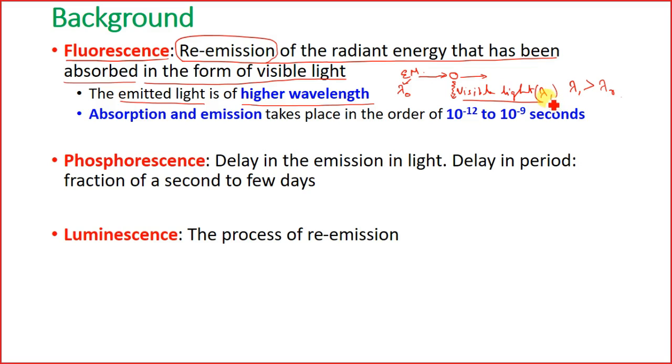Radiant, as the incident lambda naught. Yeah, in the incident lambda naught, we will have higher energy. Okay, because we have initially discussed, if there is an increase in the lambda, then there is a decrease in the energy and vice versa.